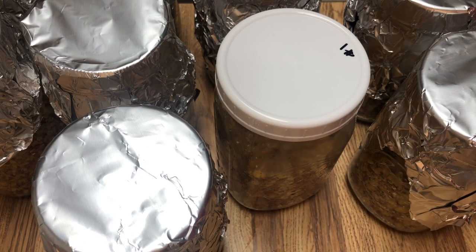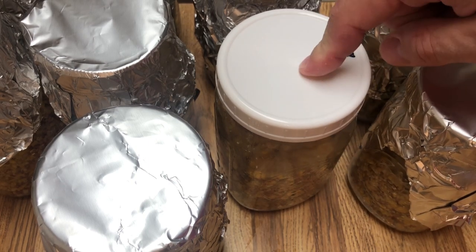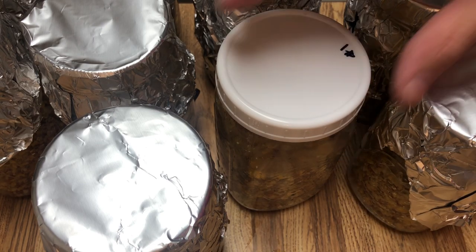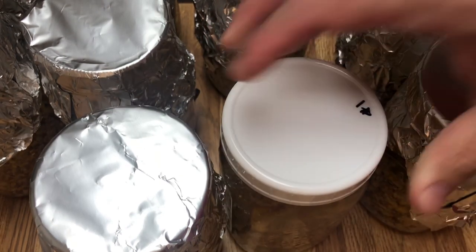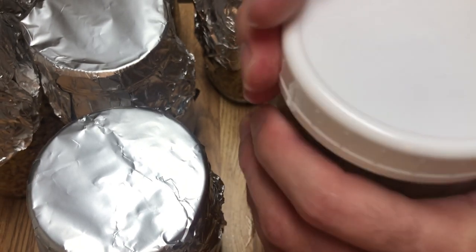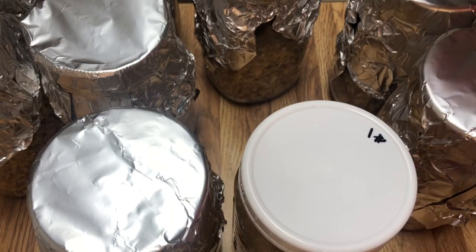Okay, so we have all of our jars tinfoiled except for one. You'll notice this jar has no filter pad on it. So I did this purposefully just to show you that a pressure cook's fine. You can do them like this if you want, unmodified. However, you just have to remember to unscrew it a little bit. You know, just tighten it and then give it a crack. That way it won't become pressurized in the pressure cooker.